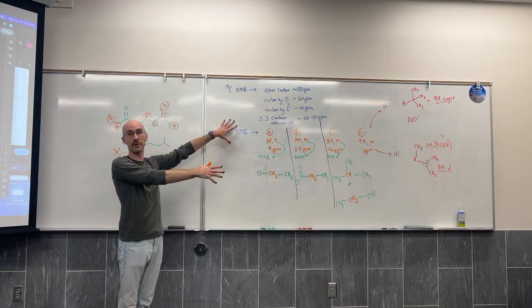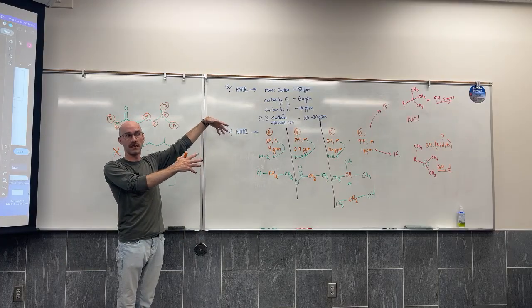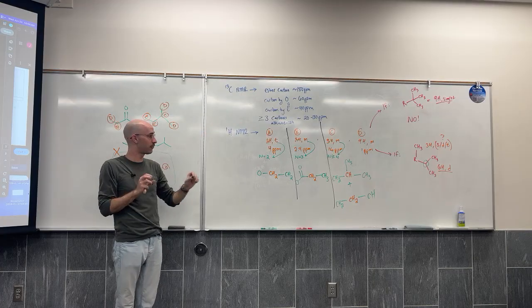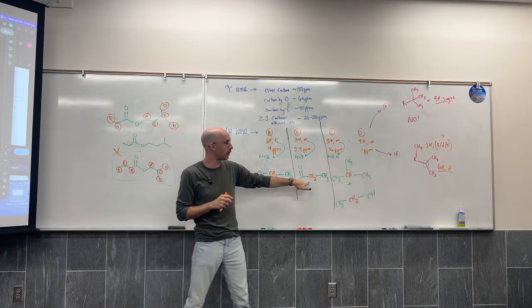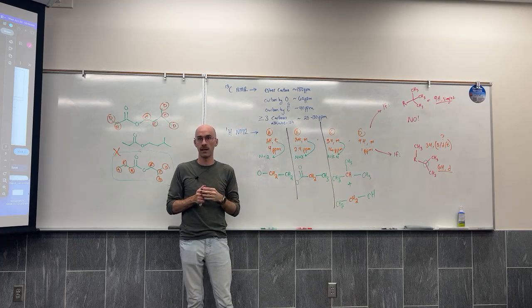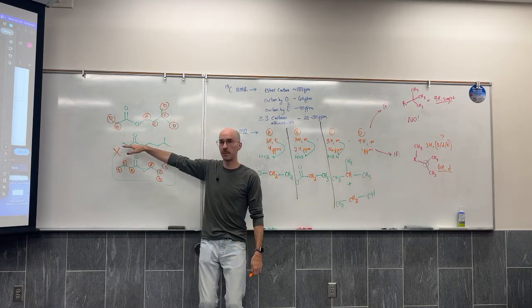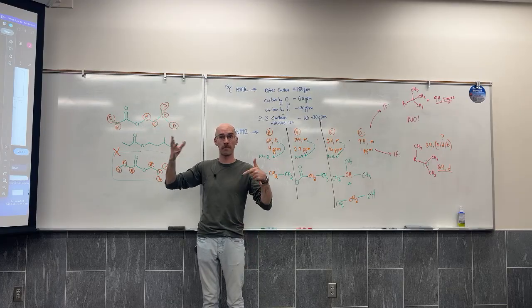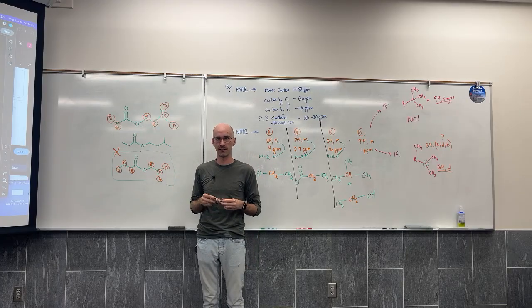This, by the way, is kind of an interesting approach. You don't need to do this approach. You can see here, I built each piece around the signal, around the information that I had. But you don't have to do that. Some people just dive in, guess and check a structure, and then start making rearrangements as they want to.